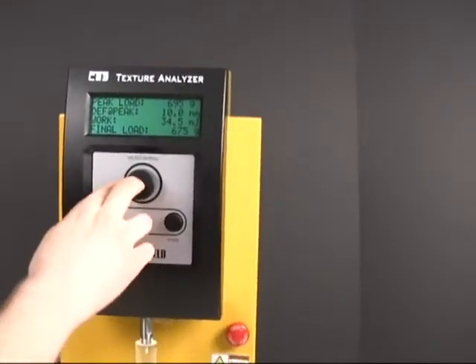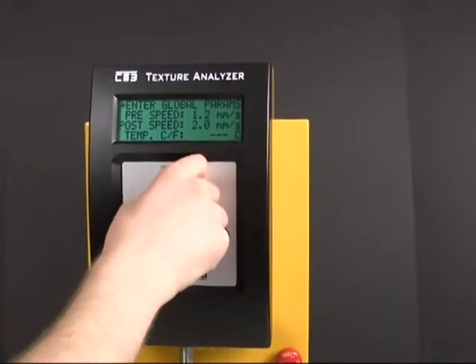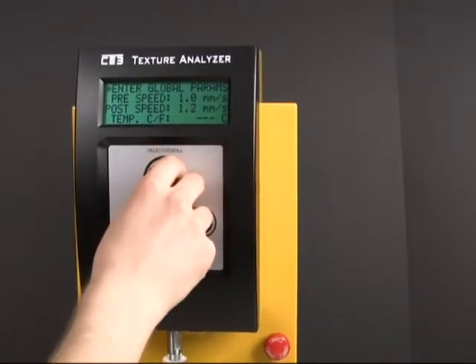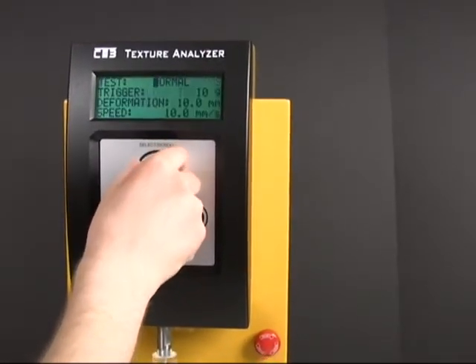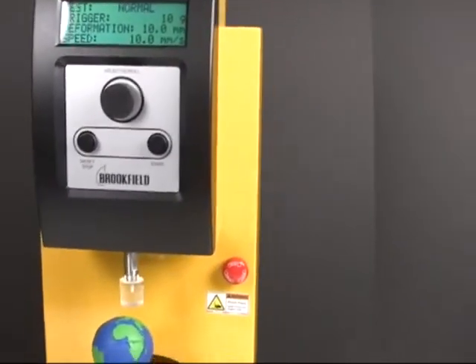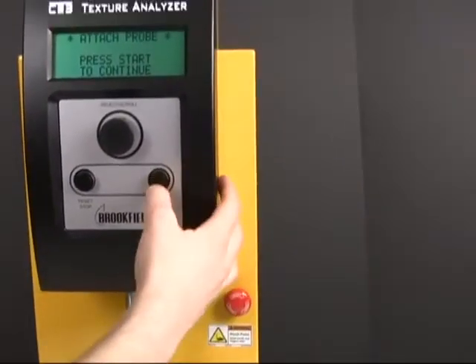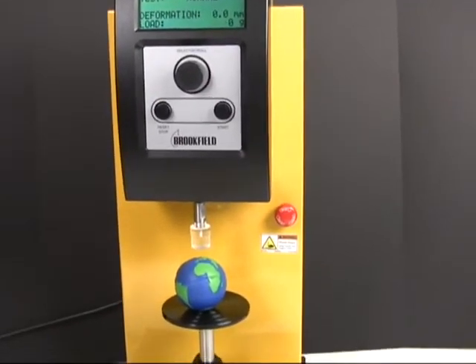I'm actually going to go back and set those back to what they used to be. Those are returning some different numbers than they should be. Okay — normal, trigger, trigger. I'm just going to run this test one more time to see what it spits out. Yes, the probe's attached — it's going to go ahead and auto-zero itself. Let's see what we get this time.